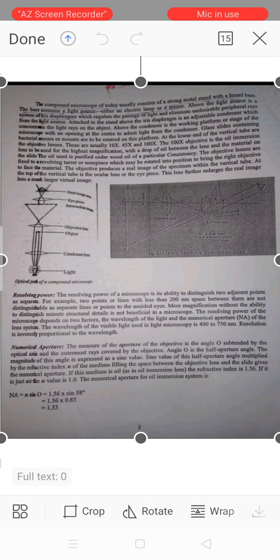An illuminator is the light source for the microscope, typically located in the base of the microscope. Mostly, light microscopes use low voltage halogen bulbs with continuous variable lighting control located within the base.